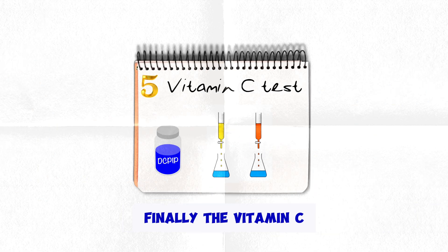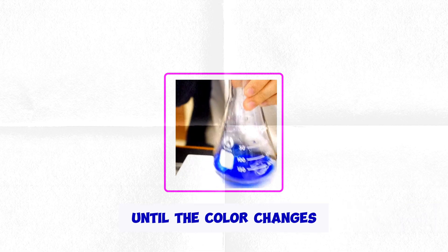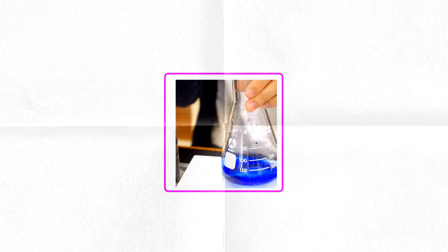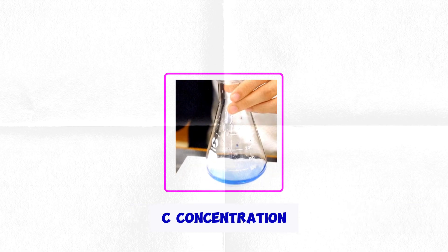Finally, the Vitamin C test. Add the juice to the DCPIP solution while swirling the flask until the colour changes from blue to colourless. The less the volume of juice required, the higher its Vitamin C concentration.